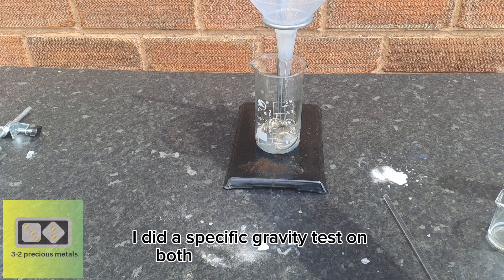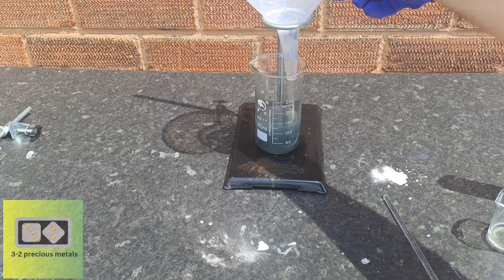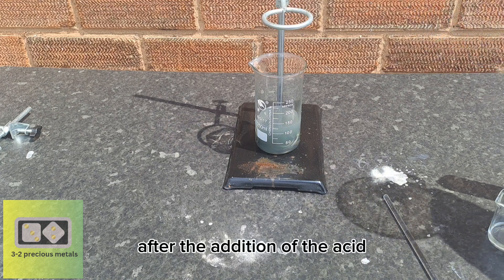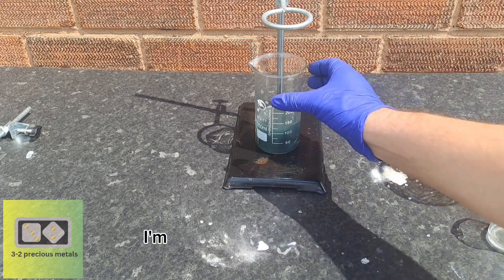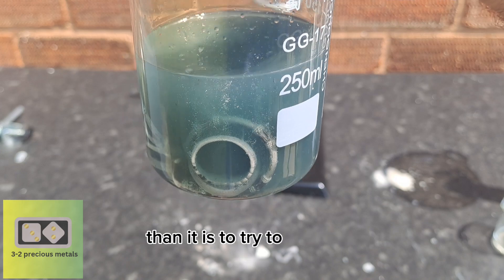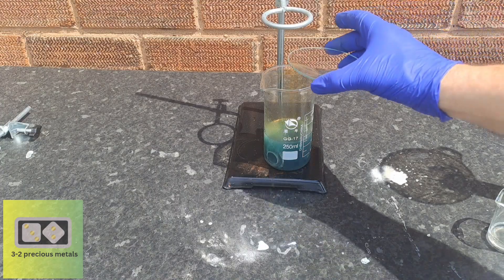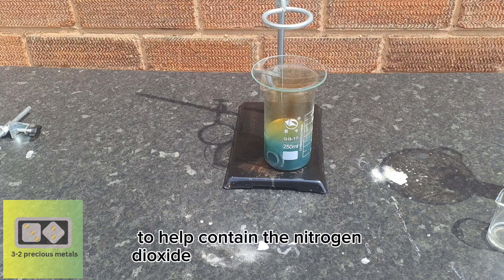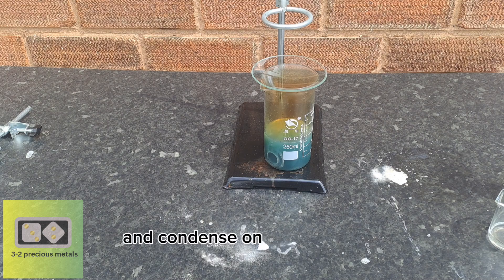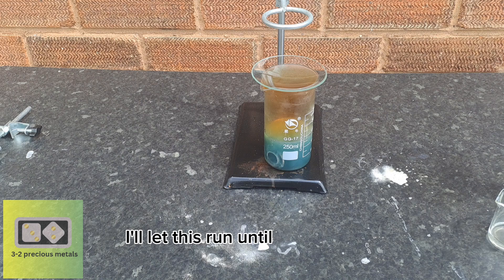I did a specific gravity test on both acids: the dilute acid came back at 37% nitric acid, and the distilled acid came back at 63%, which is pretty good. After the addition of the acid, the reaction started almost immediately. I'm letting it run without heat for now to decrease the chance of a boilover — it's easier and safer to add heat later than to try to stop a runaway reaction. A watch glass is added to help contain the nitrogen dioxide being produced; it mixes with moisture and condenses on the bottom of the glass as nitric acid, recycling it so less nitric is used.